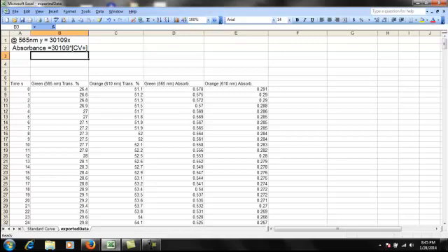Now here's an important thing to keep note of. When you are recording the time, you're going to label on your data that you're recording 0 seconds. Understand that time 0 is the time that you immediately mix the 2 chemicals together and they begin to react. You are not actually going to be measuring the absorbance at that time, so it is not truly time 0. This is just our first data point.